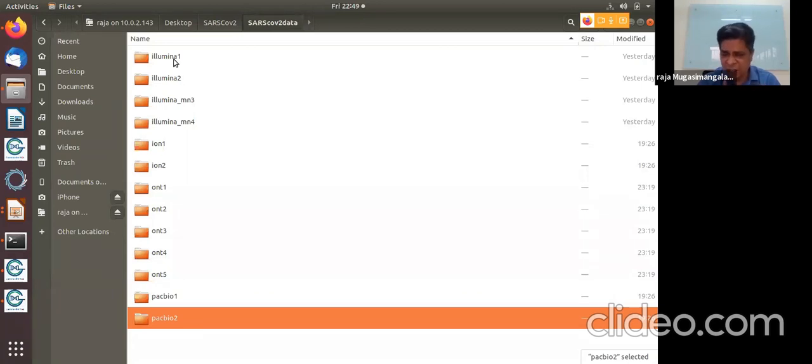So if we have 96 samples, maybe 10 times, even if I put 10 times, it should finish in 30 minutes, maximum 30 minutes. You don't need 72 hours to do analysis. Even that 30 minutes is already too much. We don't usually do it that long.